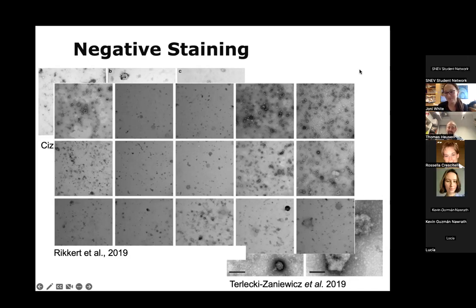Yeah, these other approaches, this cryowriter or cryosprayer, if you don't have a lot of sample, then I think they're very promising, but they're also quite expensive techniques, and only a fraction of your grid will be covered. With plunge freezing or negative stain, you typically have a whole grid to choose from which region you want to look at. And with these other approaches, there's typically only a few spots on your grid that are suitable. But yeah, it's a useful alternative that's out there.